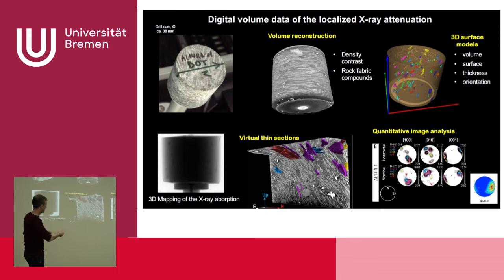If we have something in the geological field, during the formation of the Alps or something, I can see if there has been a pressure system to which maybe the growth of this mineral responds, and I can really perform some orientation maps, like here.